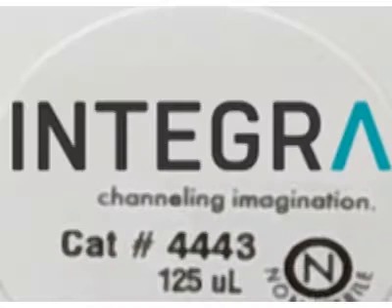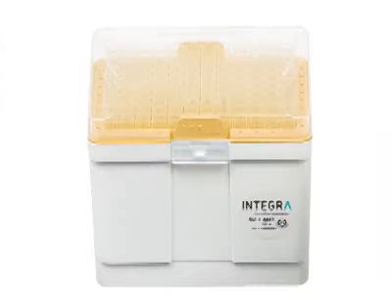Integra grip tip pipette tips have been designed to ensure the optimal functionality and performance of our liquid handling platforms.